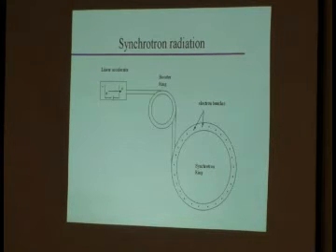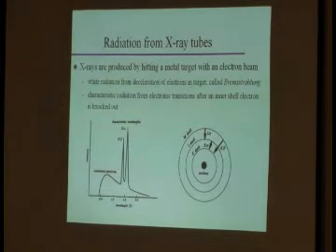So that's your X-ray tube. How about a synchrotron? Yes? How do the shells correspond to the K, L, S, and P? The K shell is the first shell, so it goes with the periodic table. The L shell is the second shell, and so on. A lot of them have multiple orbitals. The first one only has S, but the second shell has S and P, and you keep going like that. So why would one ever come down from the outer shell?